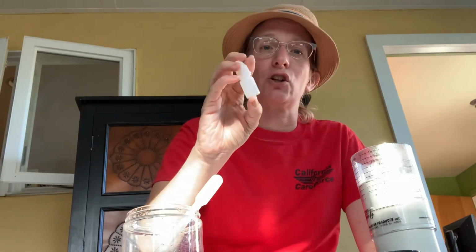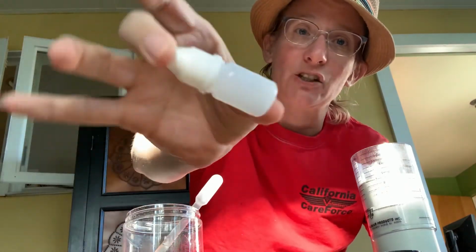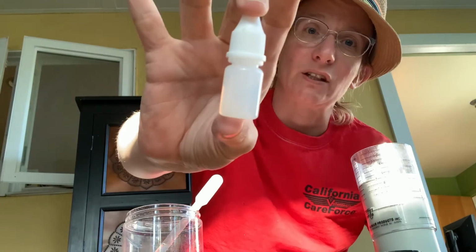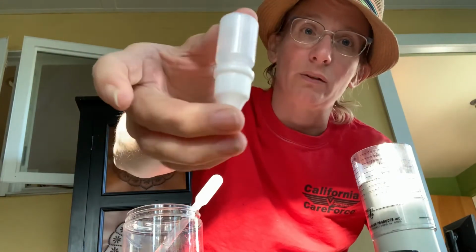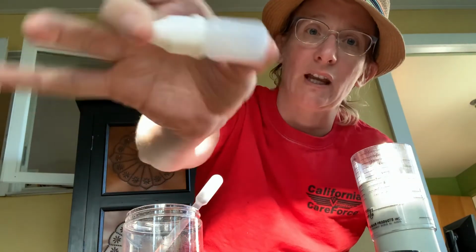When you're done with the 30-minute incubation, you're gonna take it out and look at it. Now what you're hoping for is that it's basically not changed, like this. It's just gonna be milky white. There's not really any solids or anything besides any little bits that you pulled off that matchstick in there.